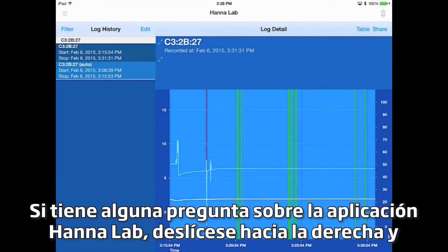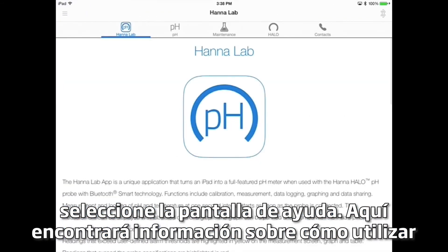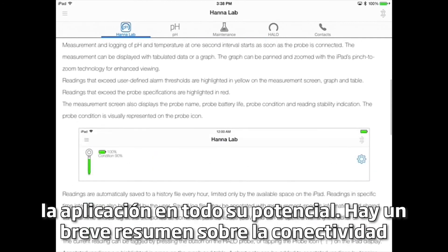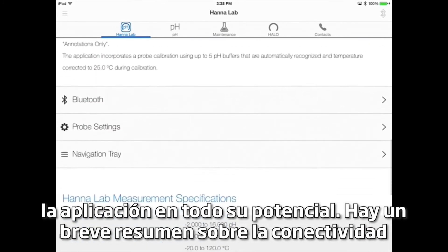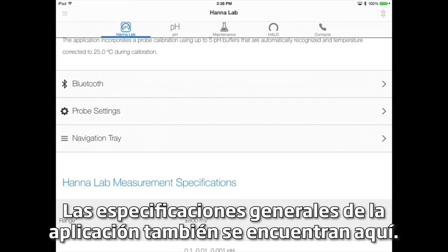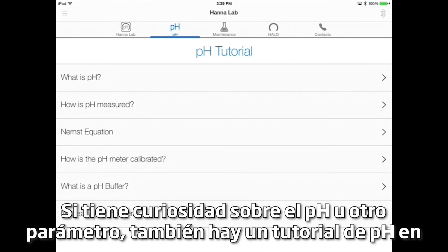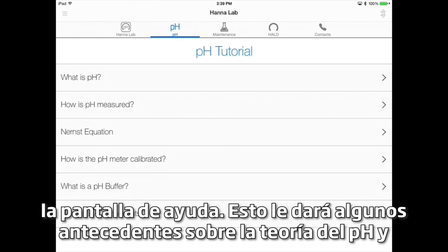If you have any questions about the HANA Lab app, swipe to the right and select the help screen. Here, you'll find information on how to use the app to its fullest potential. There's a brief summary on Bluetooth connectivity, the probe settings menu, and how to navigate through the app. The general specifications for the app are also located here. If you're curious about pH or another parameter, there's also a pH tutorial found on the help screen. This will give you some background on pH theory and some practical tips to get you started.